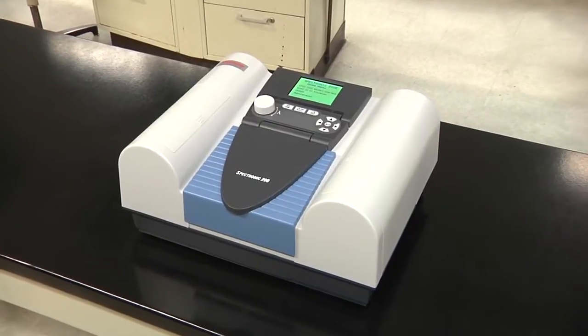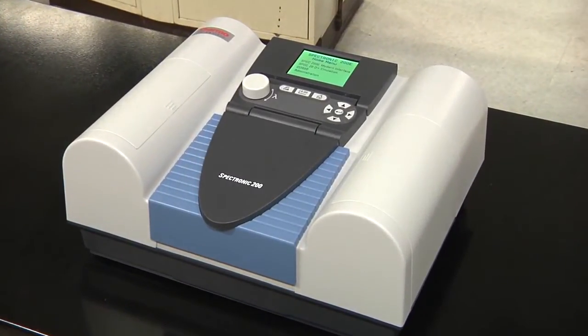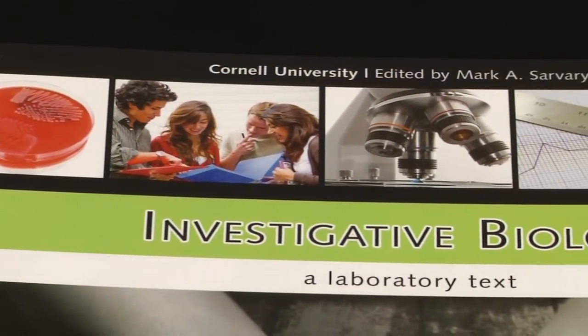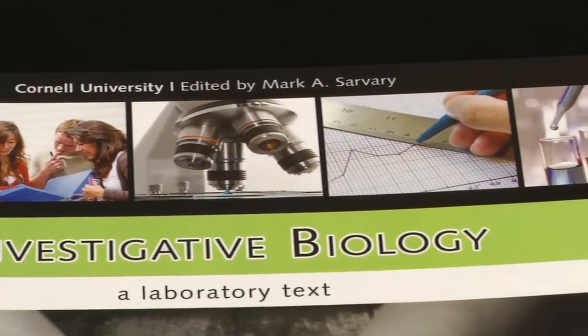This short video will provide you useful information about the Spec200 spectrophotometer. For additional information, please consult Appendix 1 in the Investigative Biology Laboratory Manual.